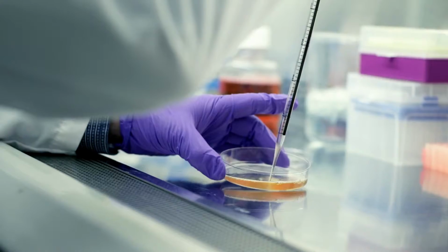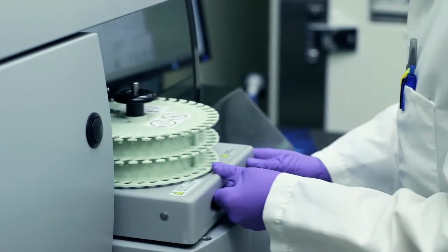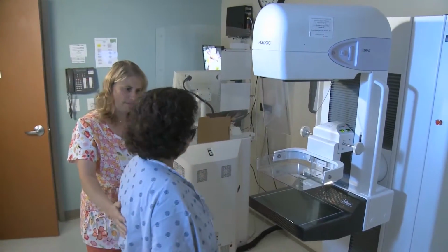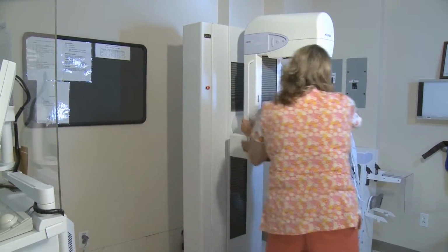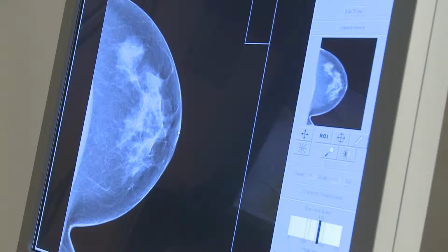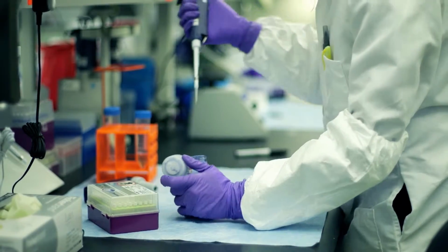Flow cytometry assays are essential for the development of modern medicines and will play a key role in the introduction of personalized medicines used for cancer patients. Right now, we're working with the breast cancer group at Penn to develop an assay to detect something called disseminated tumor cells in breast cancer. These are the cells that cause relapse breast cancer, and today, there's almost no treatment for relapse breast cancer. These cells, which are a very, very small population, go hide out in the bone marrow. They've tried doing genomics, but the signal to noise ratio is too low and they can't detect it. So we're able to find, using the specificity we have with flow cytometry, 1 in 10 million cells.